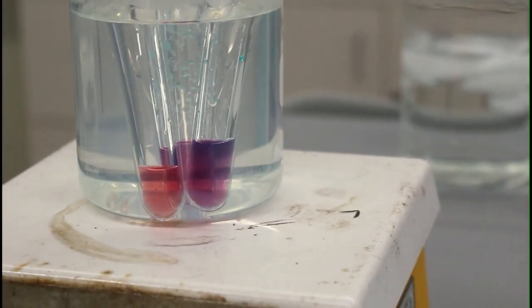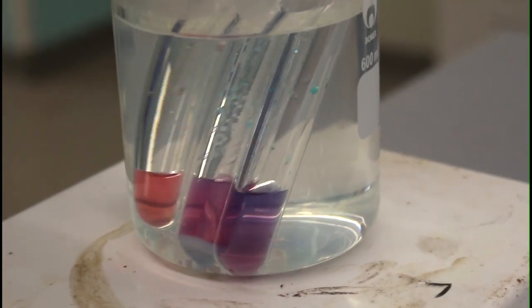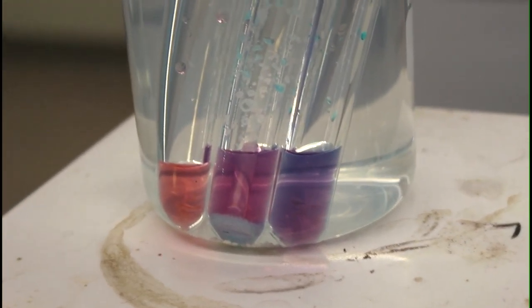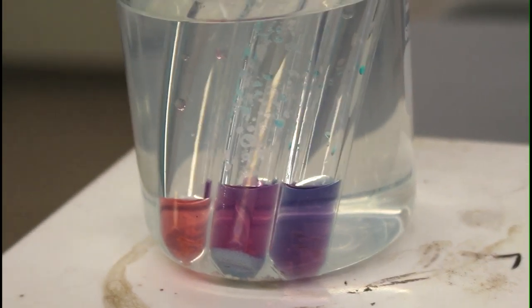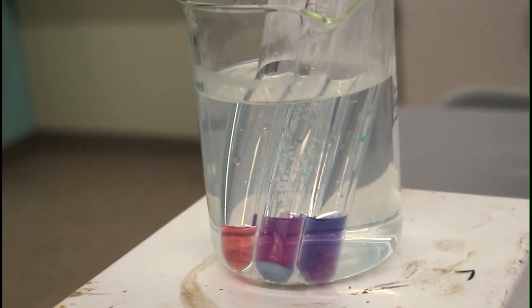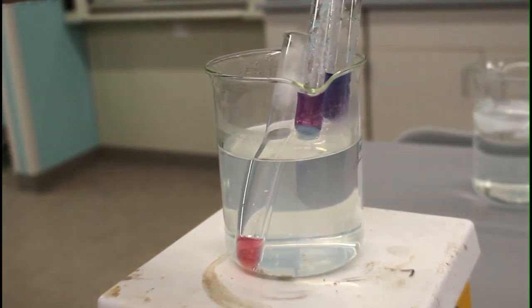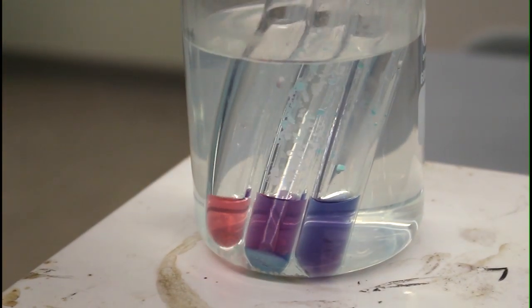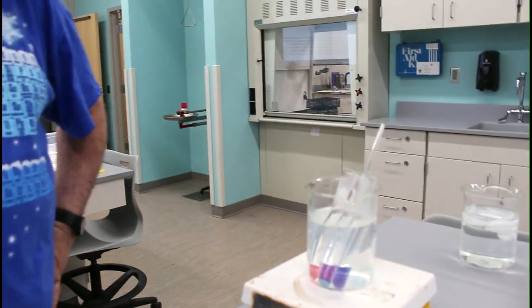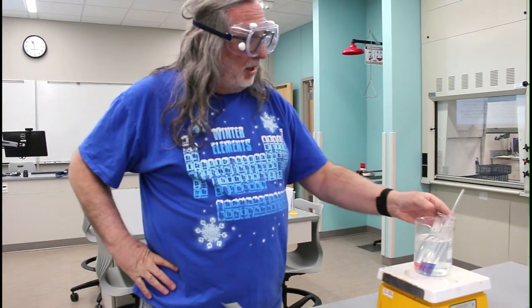If you look at what's going on here, when the cobalt water complex is the dominant species, that's where you have the pink. And when the other complex, the cobalt chloride complex, is formed, that's where you're getting the purple color. So you can see that these are going way into the purple direction as it's heating up. But this one is still relatively pink, even though it's at the same temperature as these other test tubes. And that's a good question, why? What's different about that one compared to the other 2?